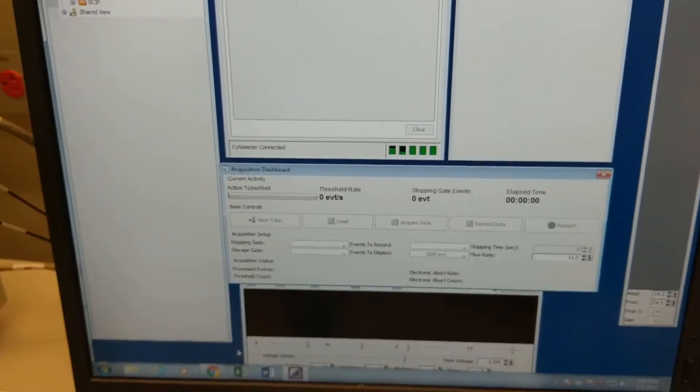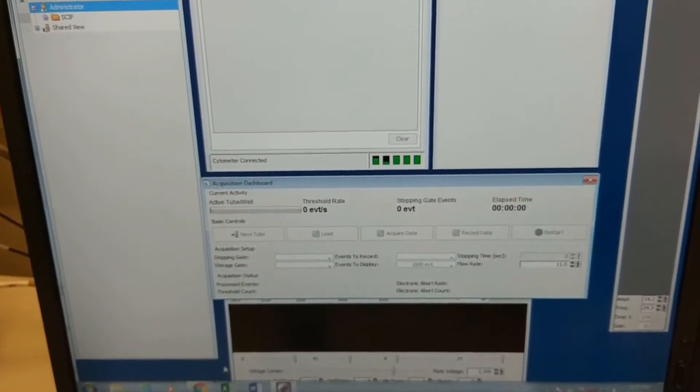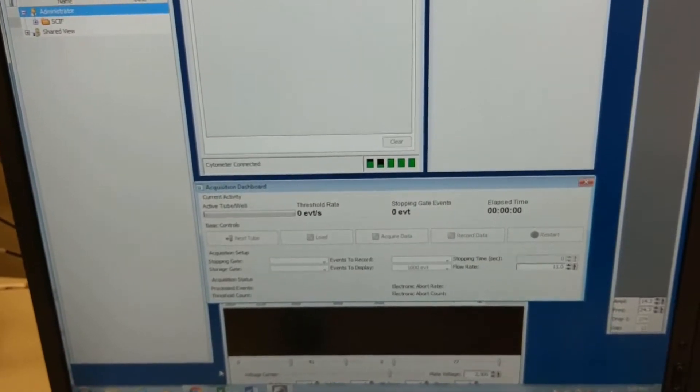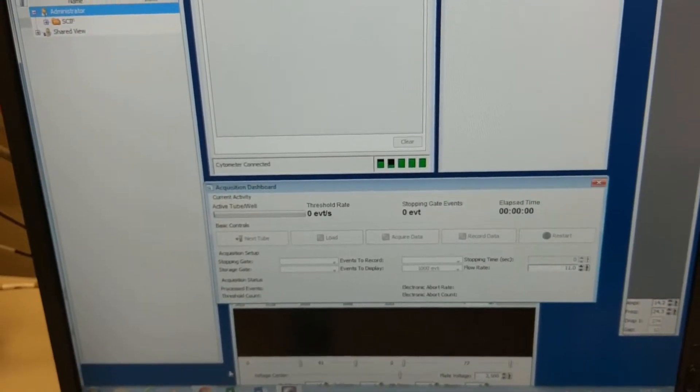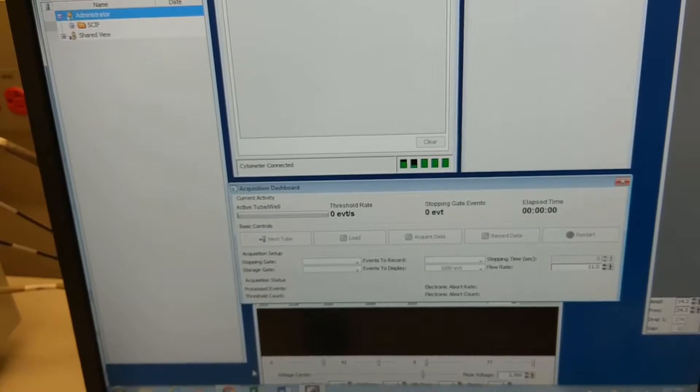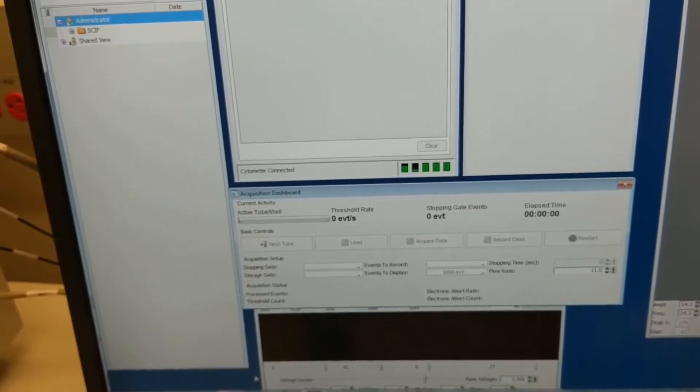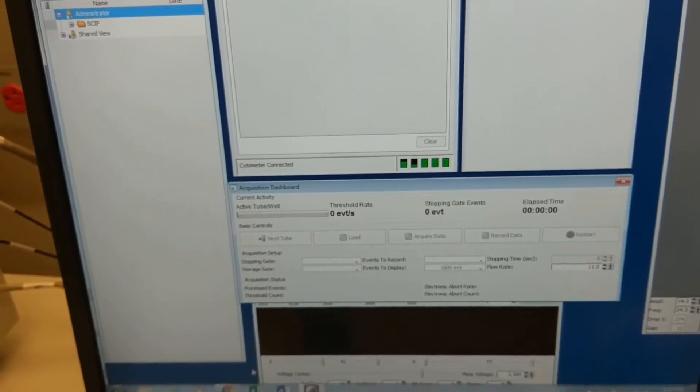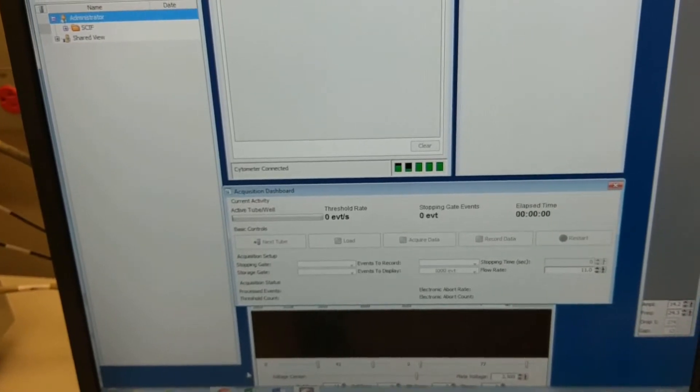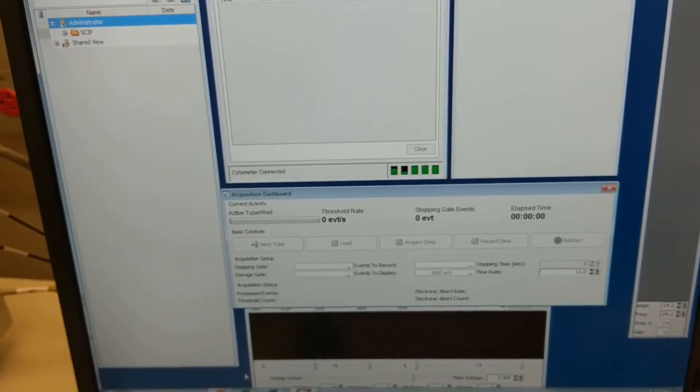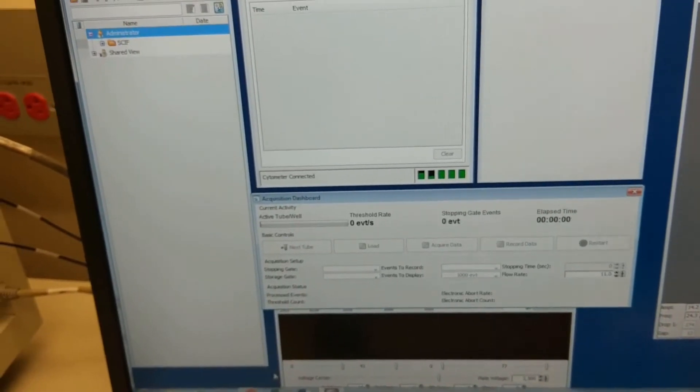I found that this is really useful, especially because when you do things like the aseptic sort command to clean the machine, or you do any priming of the tanks after refill, if those aren't full, it won't allow you to do those commands. So you have to have a functioning sensor for that to work.